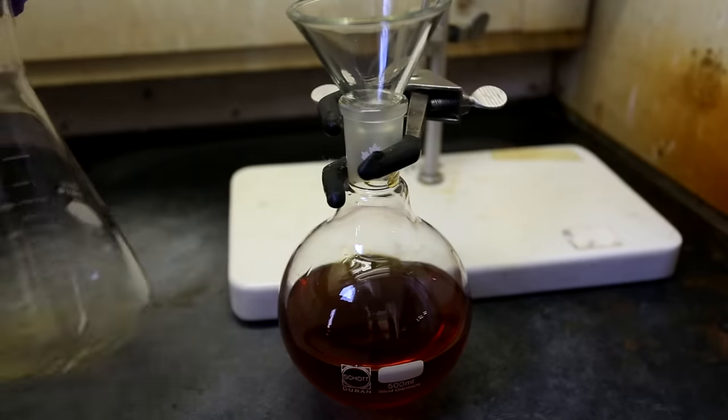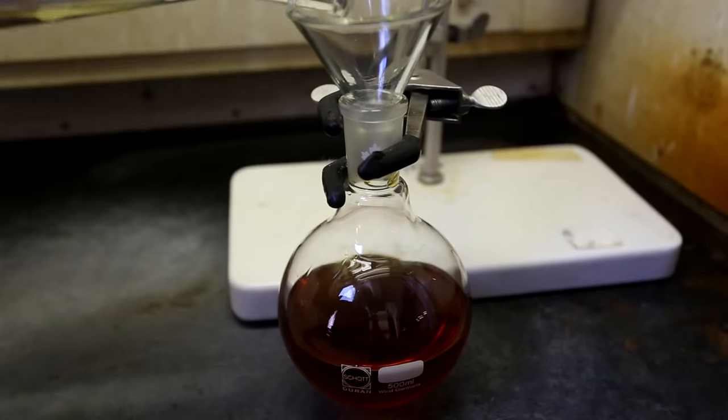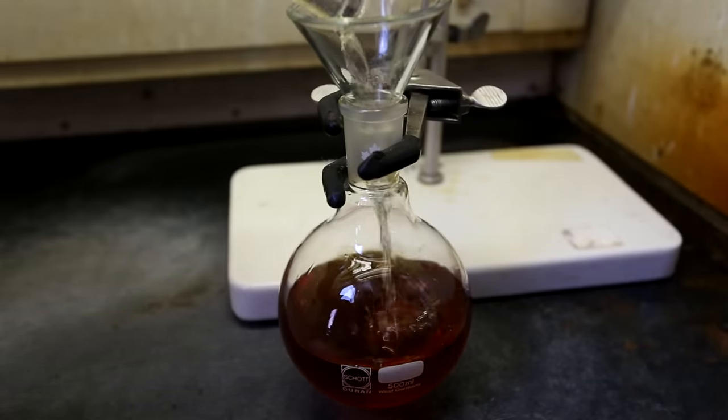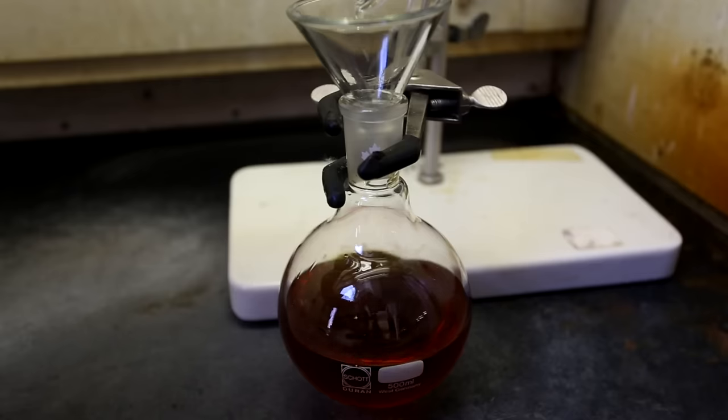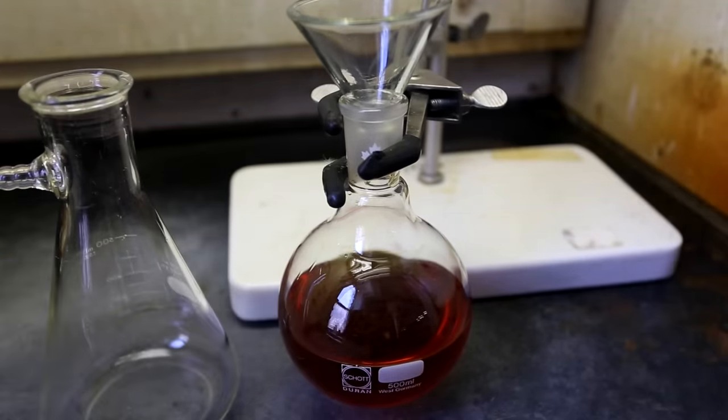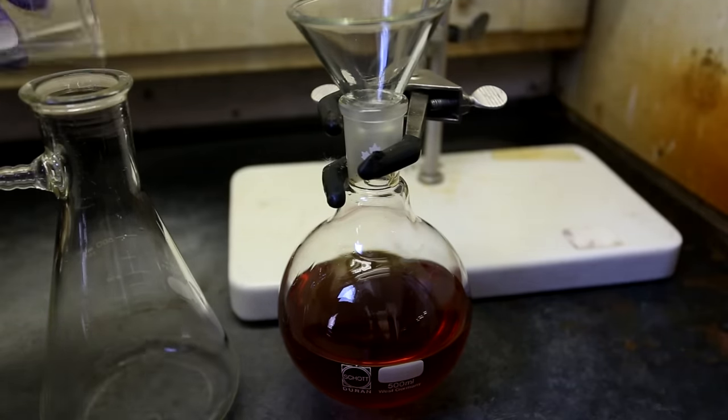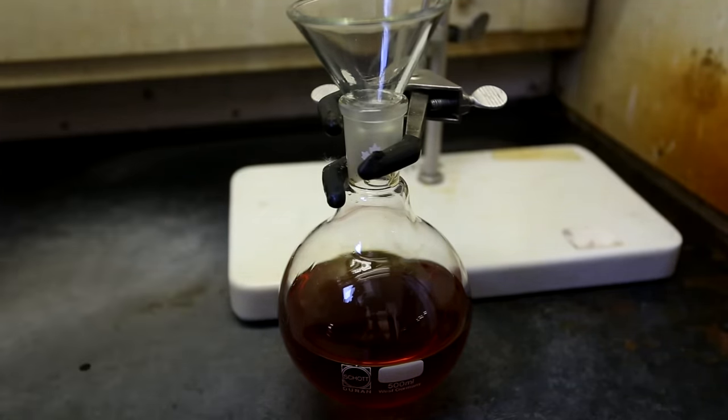At this point I'll just take a second to explain what a rotary evaporator is. It is more commonly referred to as a rotovap and basically it allows for the quick evaporation of solvent as well as the recovery of the solvent. The rate of solvent evaporation is increased by pulling a vacuum on the solvent. The gaseous solvent is recovered by cooled condenser coils.